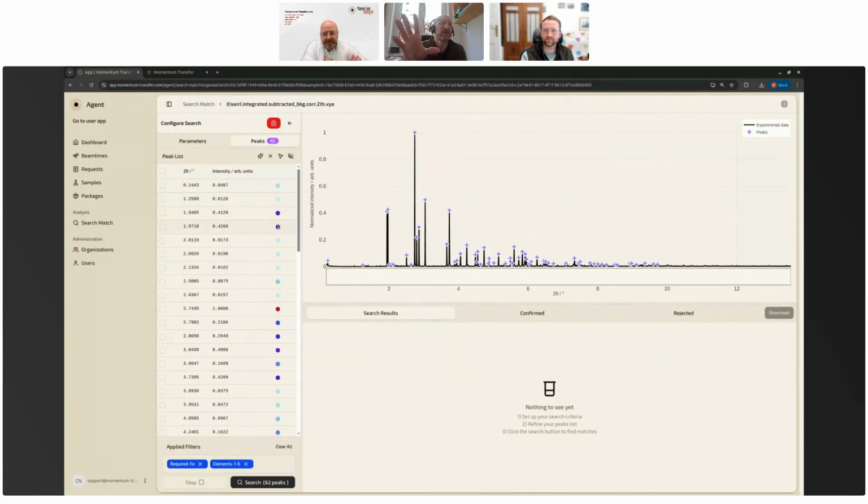And just as a convenience, you see there's a little color marker after the intensity, and that indicates which are more intense peaks. Light colors are very low peaks, darker colors are very intense peaks. You see that the red one here is the most intense, and that's because all of the patterns for this visualization are normalized to the maximum intensity. So the max intensity will always be at 1.